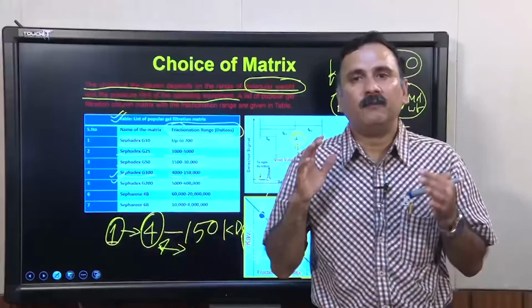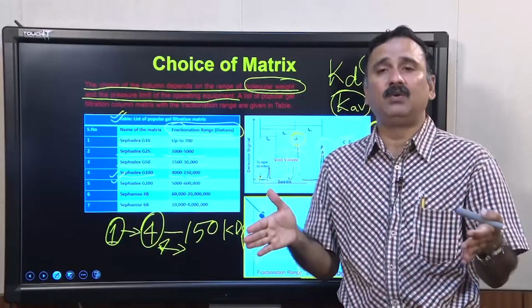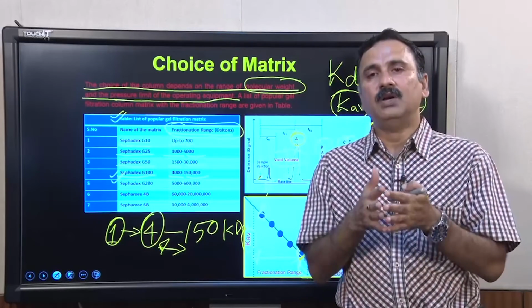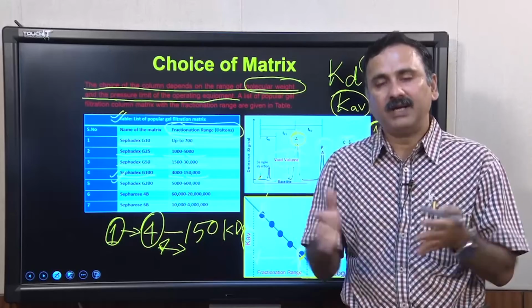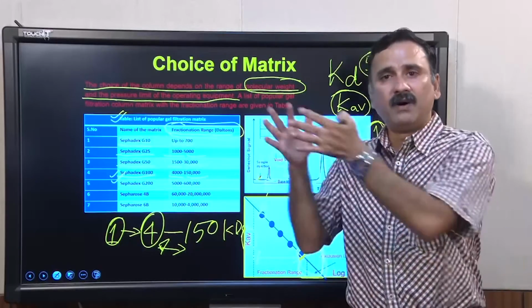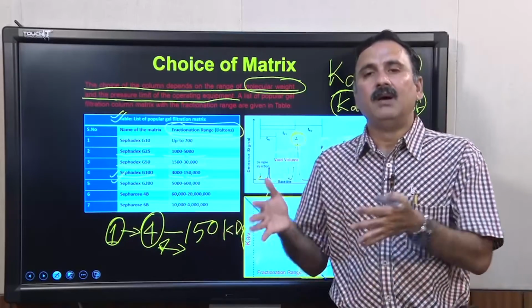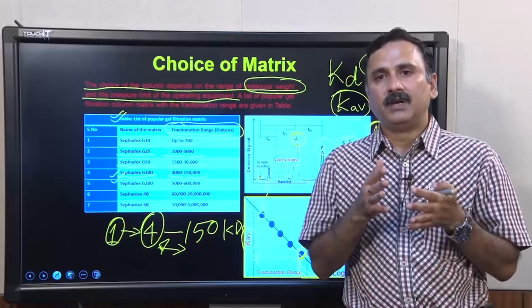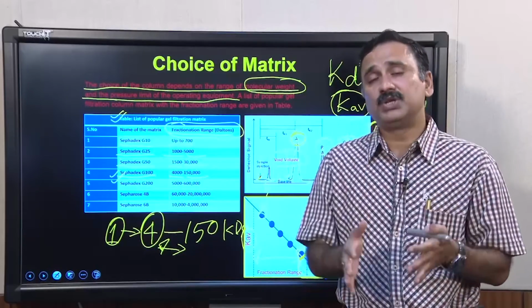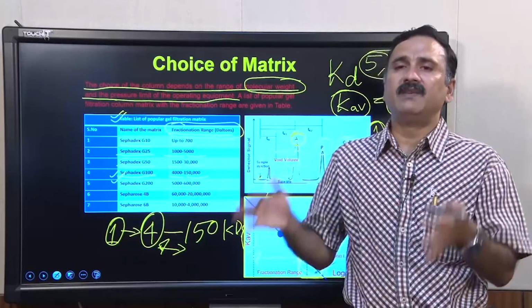So, within this particular range, the column is efficient enough to separate the molecules, whereas if you go above or below that, it will still be able to separate, but you will not see the two individual peaks, which means the resolution of the column is compromised beyond the fractionation range.